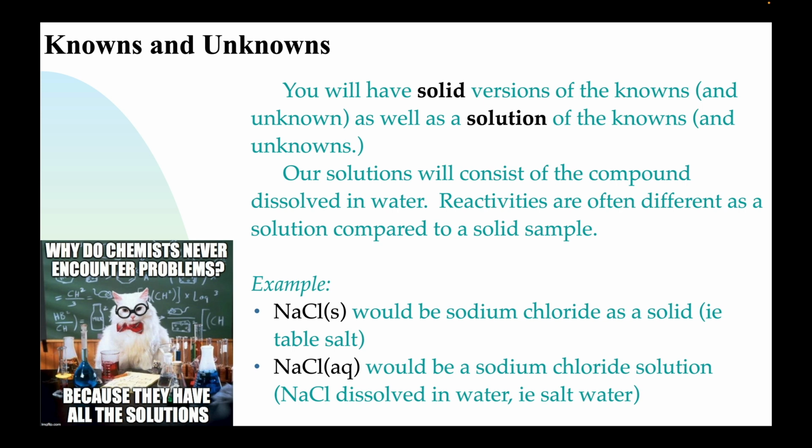And you're going to have versions of all of these knowns and unknowns present. So you'll have a solid version of the sodium salts as well as a solution version. You'll be able to write S next to the solid version and AQ next to the solution version. All of these dissolve well in water. That's why it works out really well. And solutions tend to react differently than the solids often. So that's why we're using both solids and solutions here to see what's happening.